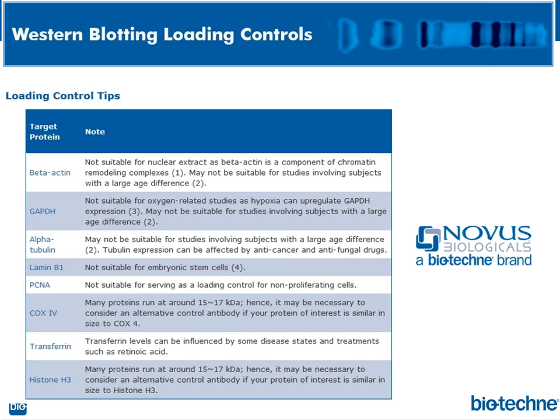That recombinant protein treatment, or you're using a Tocris inhibitor, or using RNAi, or you've got some kind of mutation. The point is this: the experimental treatment can affect the expression of the housekeeping or the normalization gene. So you don't want to use it.